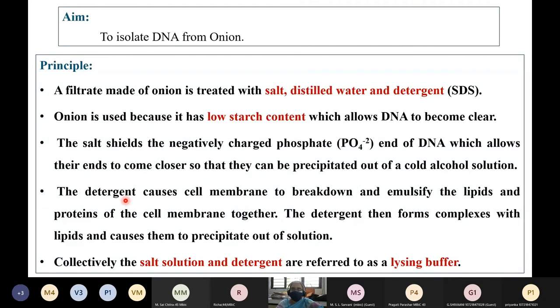The detergent SDS, sodium dodecyl sulfate, will cause the cell membrane to break down and emulsify the lipids and proteins of the cell membrane together. The detergent then forms a complex with the lipids and causes them to precipitate out of the solution. Collectively, the salt solution and the detergent are referred to as the lysis buffer.